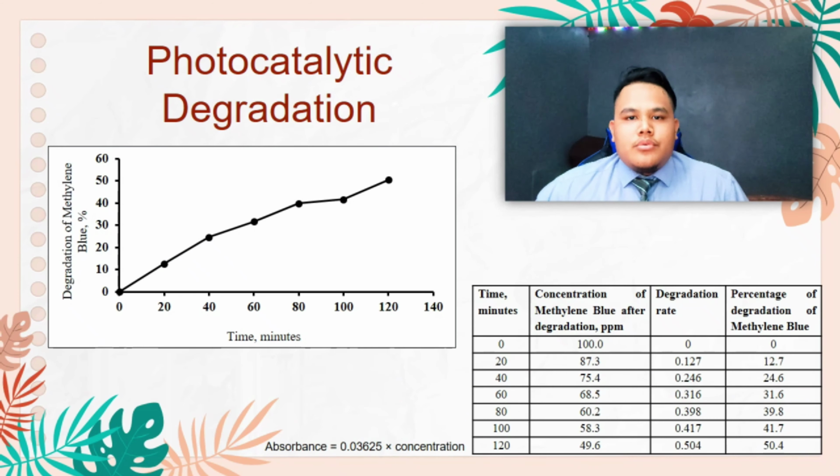The data for methylene blue degradation are summarized and shown in the table. The perovskite oxide as a photocatalyst was then tested for the degradation of methylene blue at a concentration of about 100 ppm. From the graph, it can be observed that the percentage of degradation of methylene blue is 12.7% for 20 minutes of degradation time and 50.4% for 120 minutes of degradation time.